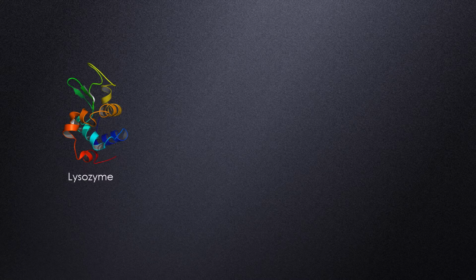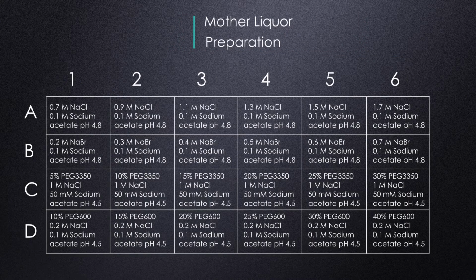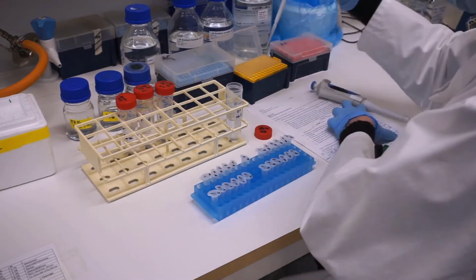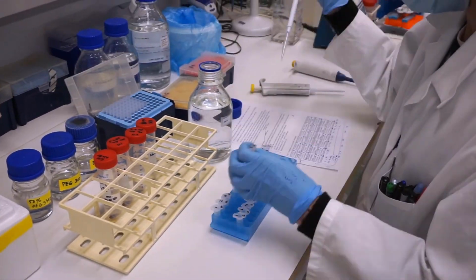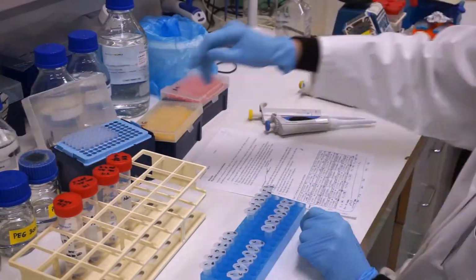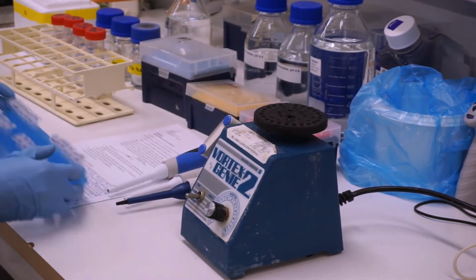In this experiment, we will crystallize lysozyme at a concentration of 20 mg/ml. We are using 24-well plates with varying conditions for crystallization using the hanging drop method. Prepare the mother liquor solution according to the table. Then, vortex all prepared solutions.